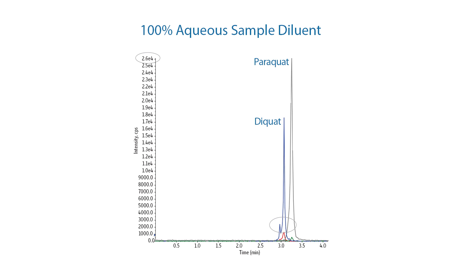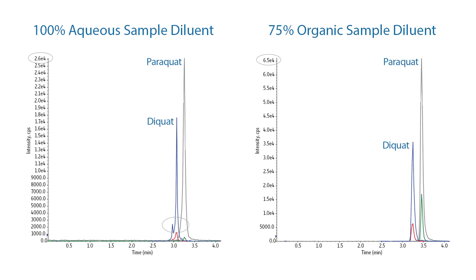Compared to sample prepared in 100% aqueous solution, the sample dissolved in 75% organic solution to match the initial mobile phase condition resulted in the chromatogram with not only better peak shape, but also increased retention and higher sensitivity.